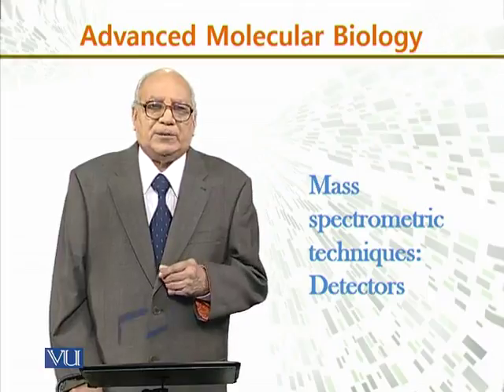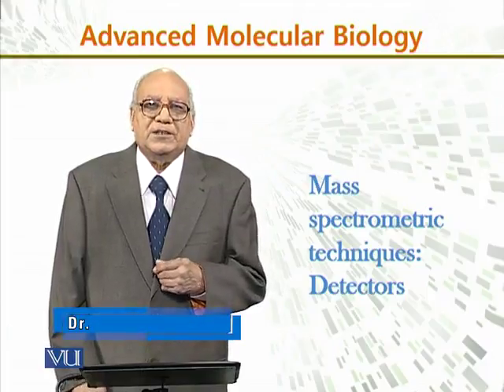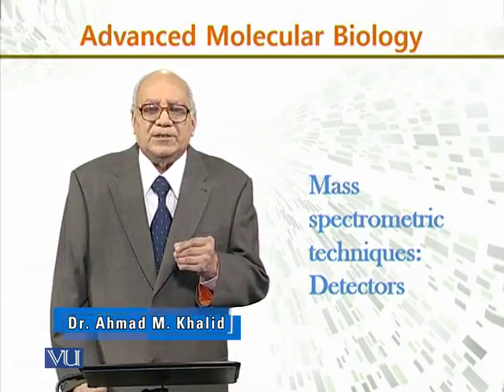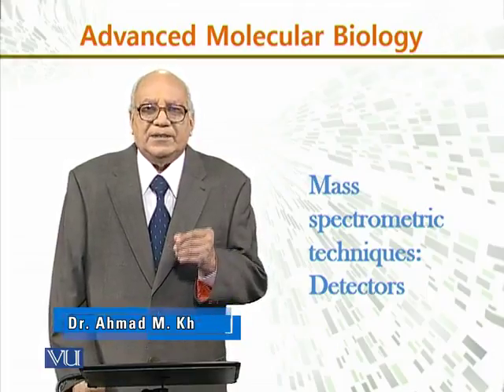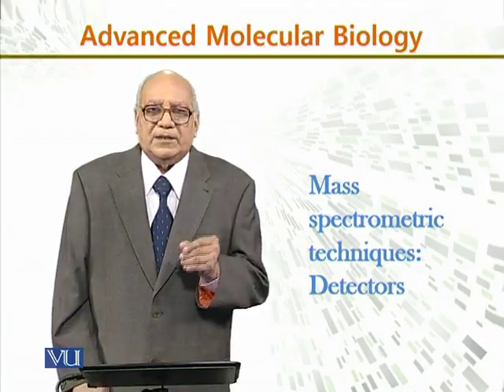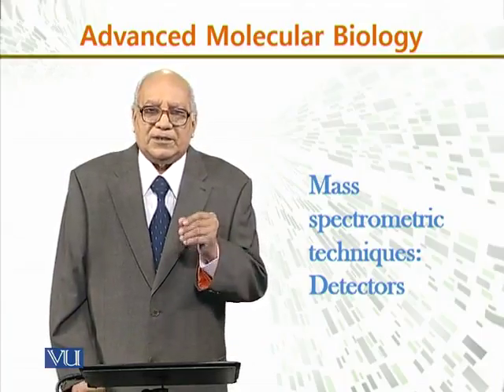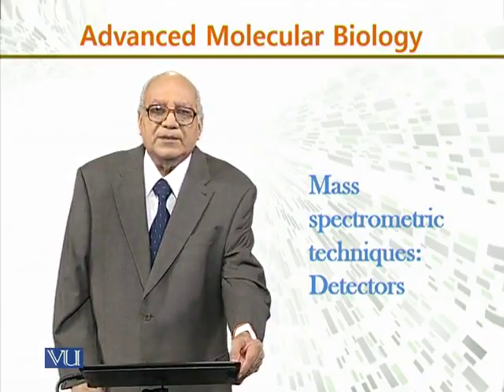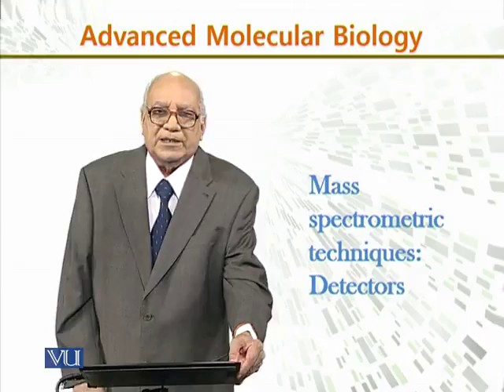One important aspect of these techniques is the use of mass spectrometric techniques and the use of different detectors. In this segment, I will discuss the role of the detector in mass spectrometric techniques.